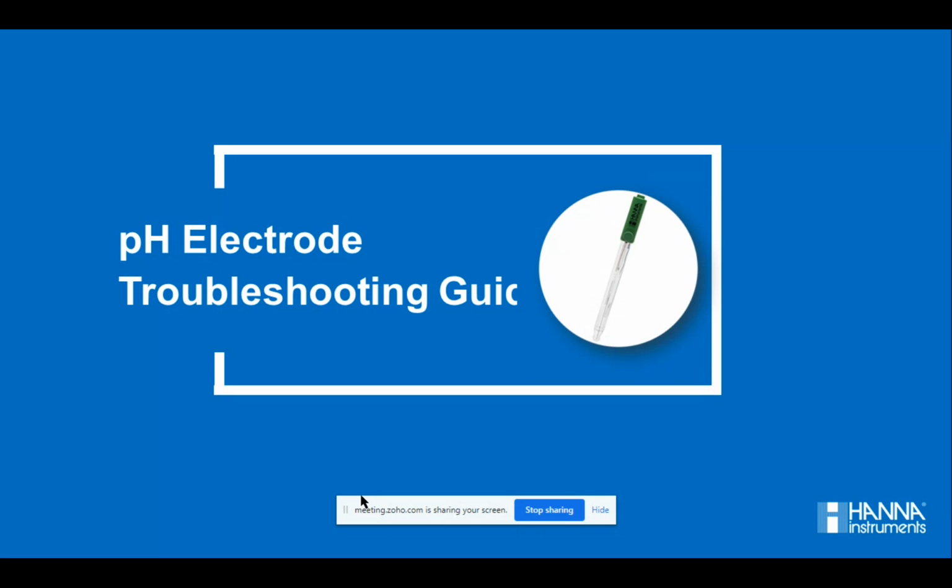Yes, of course, a pH electrode is efficient when you select a correct pH electrode according to your samples. But this subject is for another webinar we're going to be discussing. But this is very important. Whichever pH electrode you use, you should be able to maintain it, you should be able to store it, and if time comes, you have to be able to troubleshoot as well, so that your pH measurement is hurdle free, and you can consume the maximum life of a pH electrode.